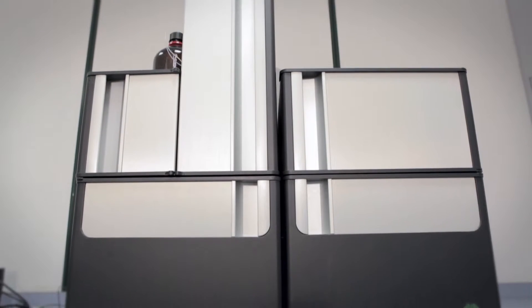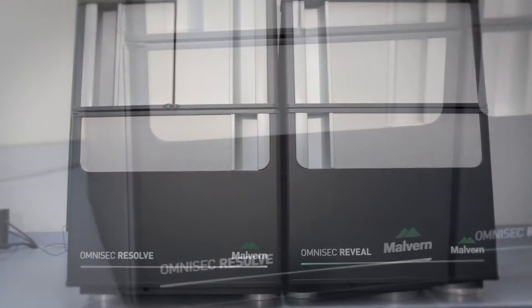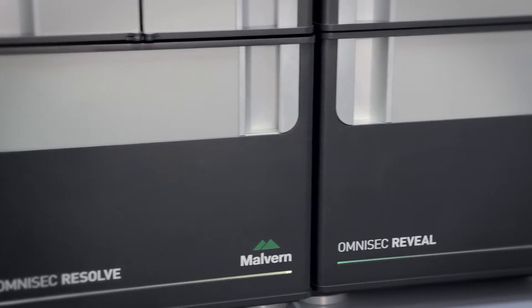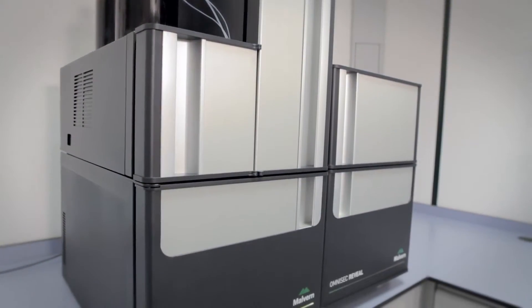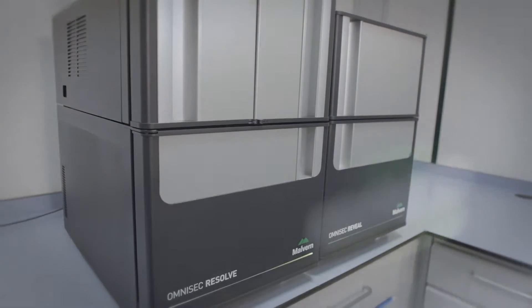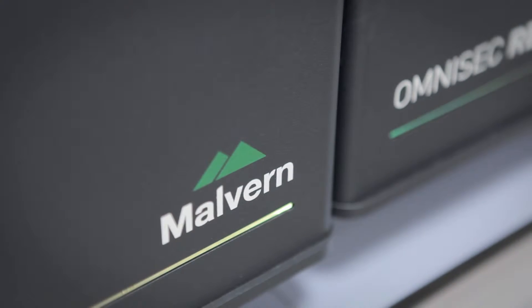Omnisec is the latest size exclusion chromatography or gel permeation chromatography system from Malvern Instruments. It's a completely new product developed using our 30 years of SEC and advanced detection experience. The developments we've put into Omnisec mean we think it is the best tool on the market for measuring molecular weight and structure. With this information, our customers are improving their polymers' physical properties, maintaining product quality, and developing safer and more effective pharmaceuticals.